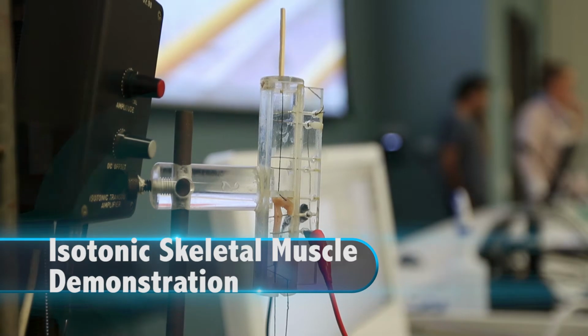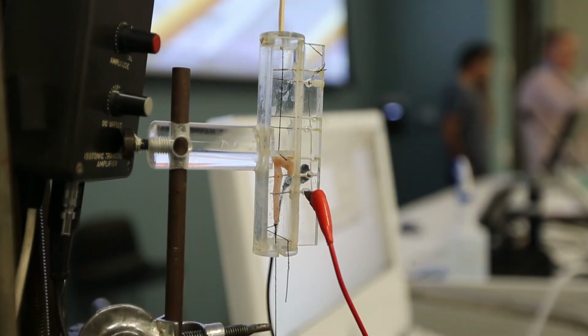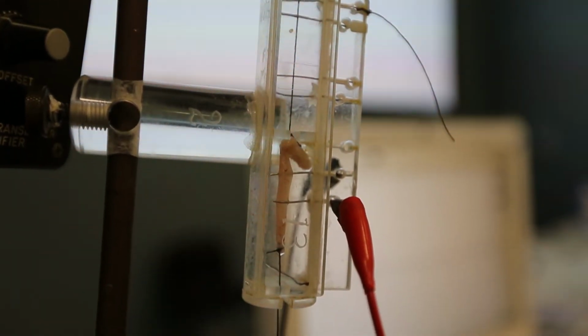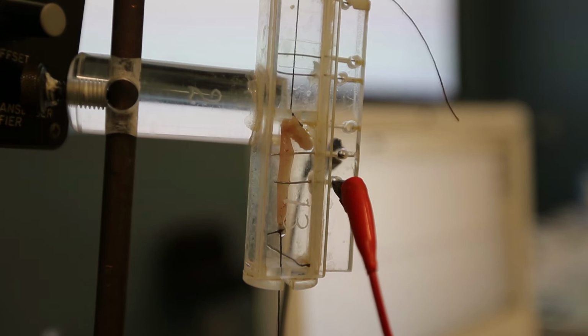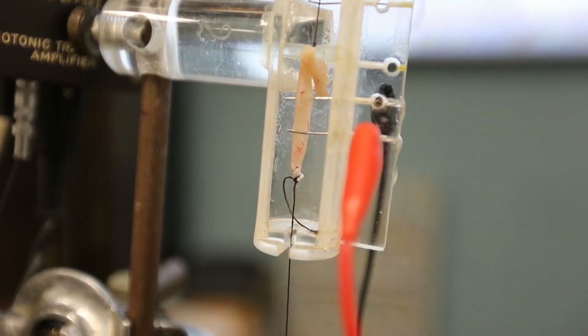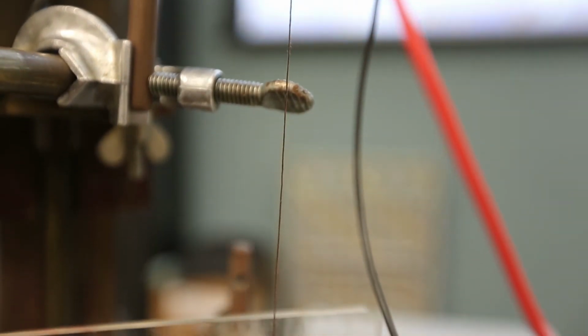So what we've done is we've had the muscle dissected from the cane toad again this morning, and this time, again, the proximal end, so the end with a little bit of that pelvic bone attached, is fixed to our specialised muscle chamber here. But the distal end this time is free to move. Okay, so obviously now we're going to be stimulating the muscle to contract, and this time the muscle will shorten.